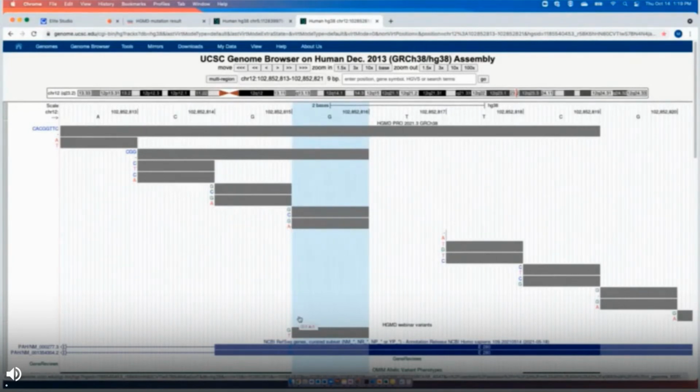And so this is something that, as part of ACMG, you can use as a piece of evidence if these are then shown to be pathogenic. That tells you that this codon has some sort of functional importance. And so having this kind of neighborhood view to see what's upstream or downstream can be very helpful at times.